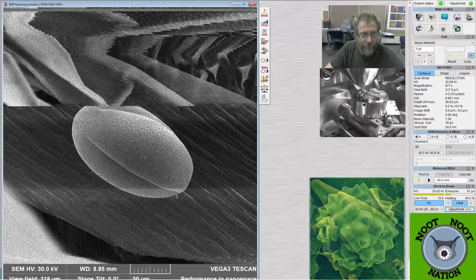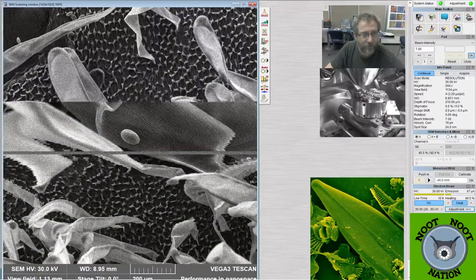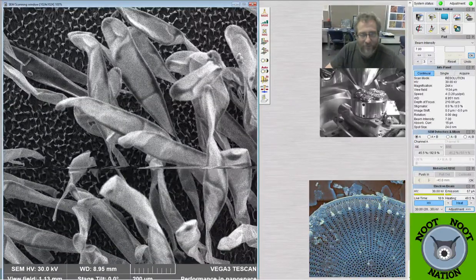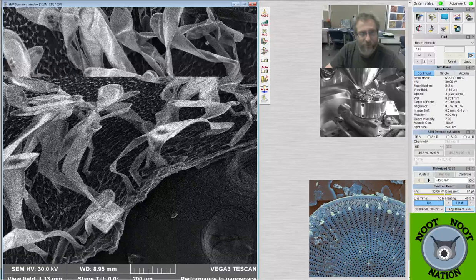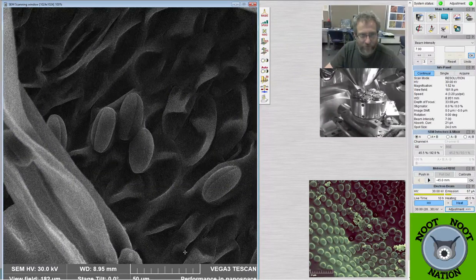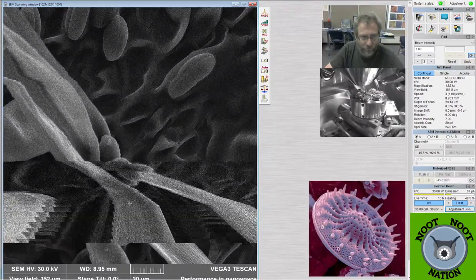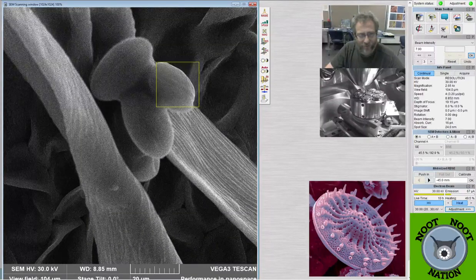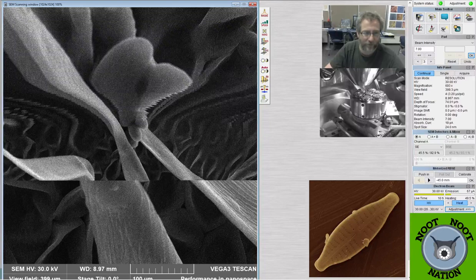So probably they just belong to a similar class of pollen type, structurally designed pollen types, as redbud. But I suppose it's always possible that I just got some all over me. And if there was a lot, which there is, it's easy to transfer. So these look pretty safe. That looks like a pretty safe bet that that actually belongs on that plant, because it's under things. And this one looks like it's clumped together in a cluster under some sort of a layer of plant material. So unless that whole thing came over together, I think that's probably part of the same plant.